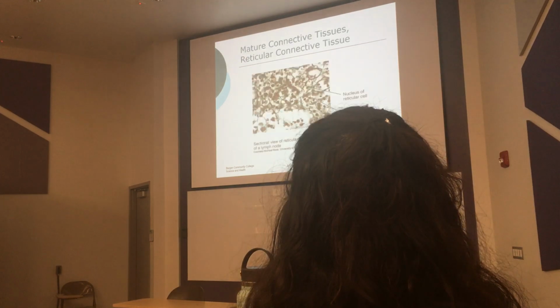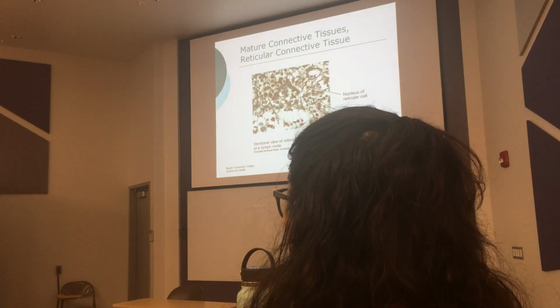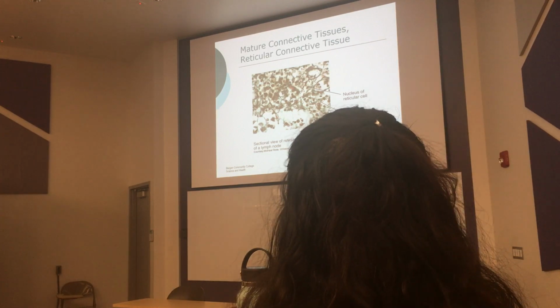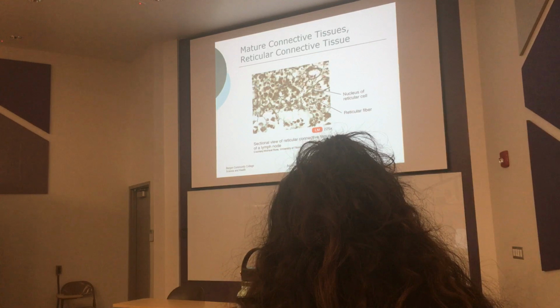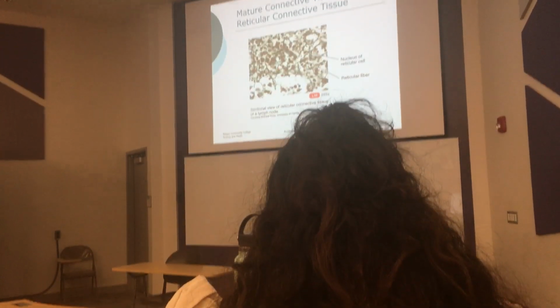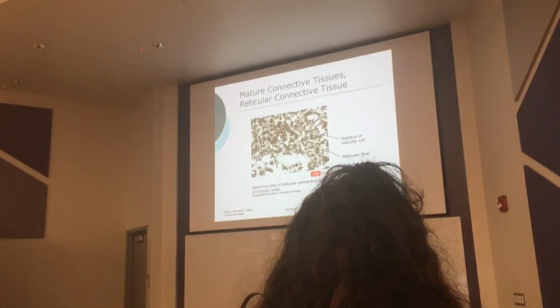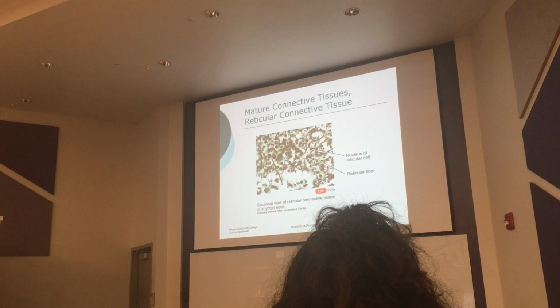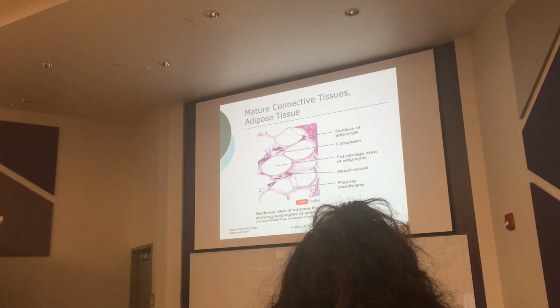Remember those old fish filters? You guys are kind of young; you just buy them now. With the old fish filters, you had to put cotton in them and charcoal. These are all the white blood cells in there. This is the matrix, so it kind of looks like cotton. The white blood cells are the black guys here, and these are just the nuclei. So that looks a lot different from that, and from that too.